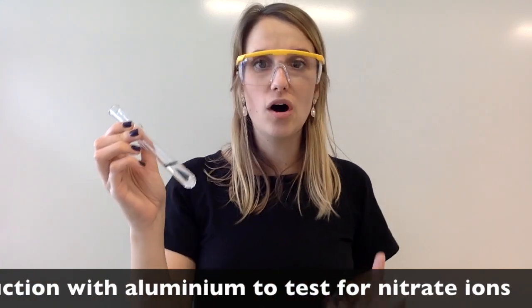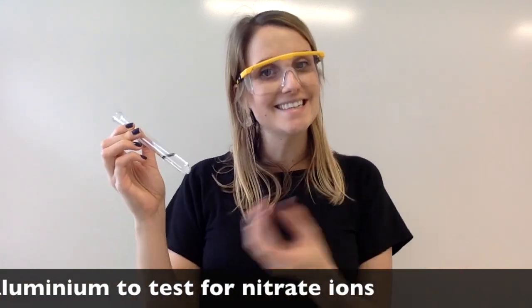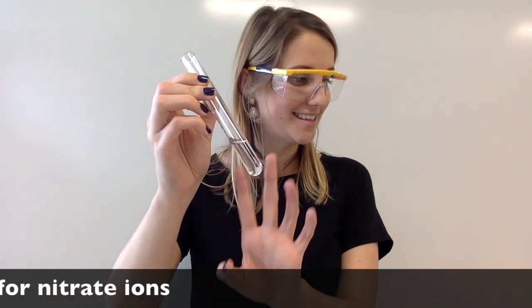Here's a sample of unknown solution, but it contains nitrate ions which we're going to prove are there today.